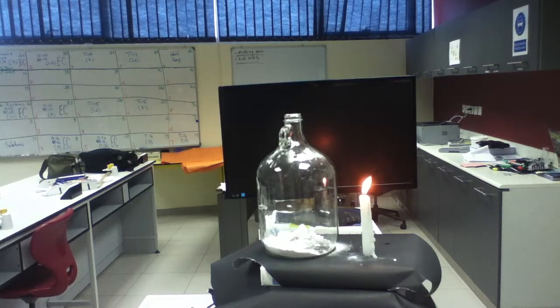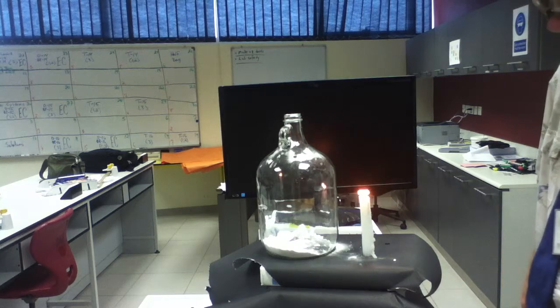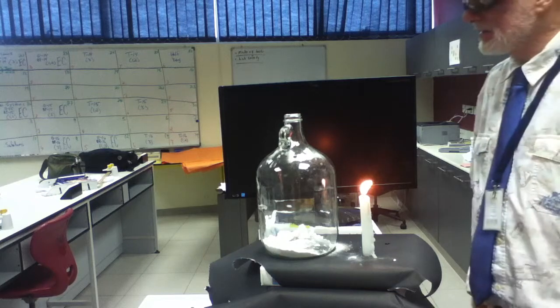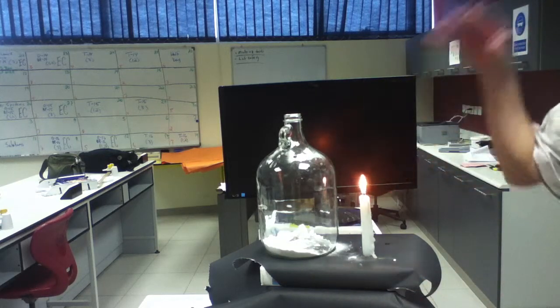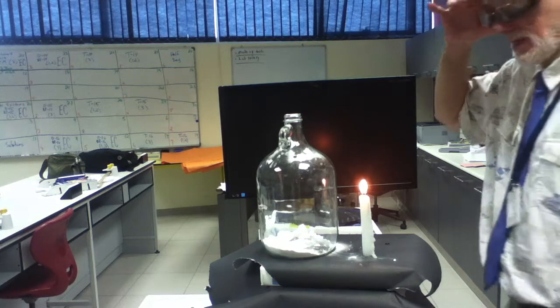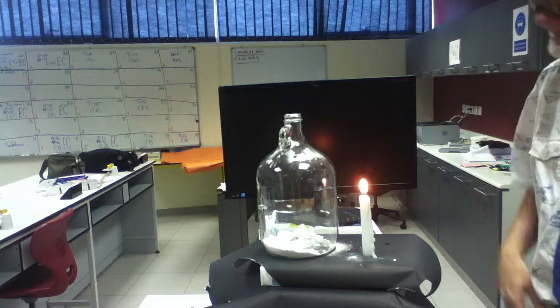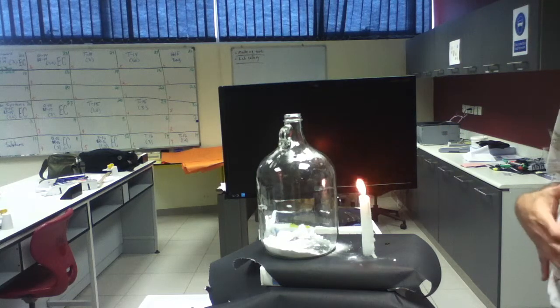Okay, well, this is going to be trial 2. I'm going to splice this together, so if you're seeing this right back to back, you'll know why. It seems a little weird. Okay, what I'm going to use is the same stuff. I have goggles on this time. Okay, see my goggles. Okay, I'm using 6 molar HCl. Not something you want to get in your eyes. It's about 6 times more powerful than stuff in your stomach.